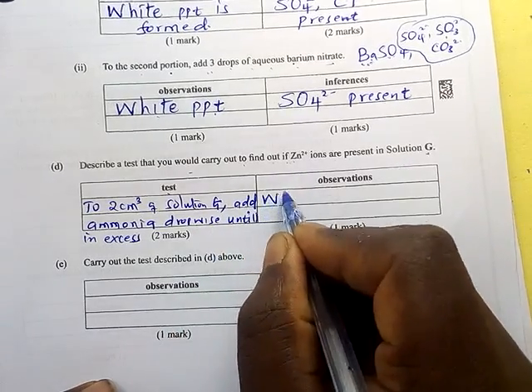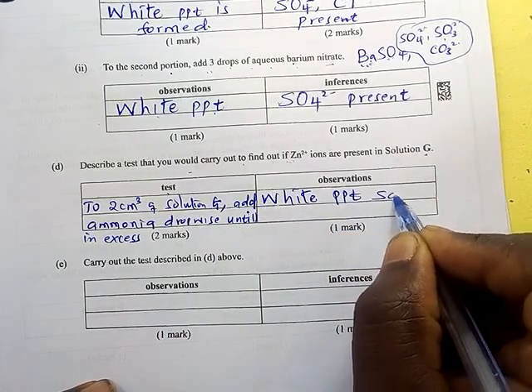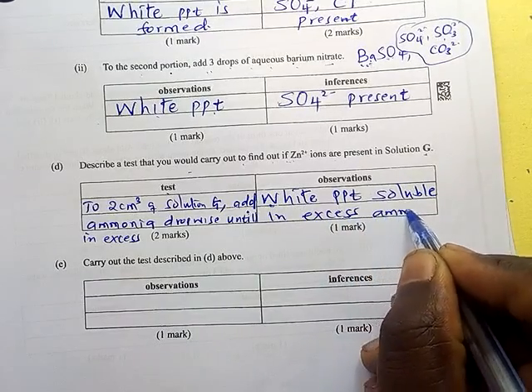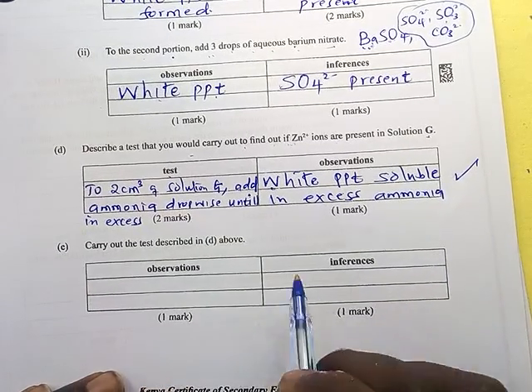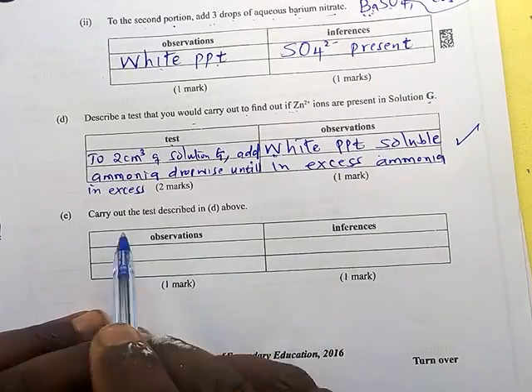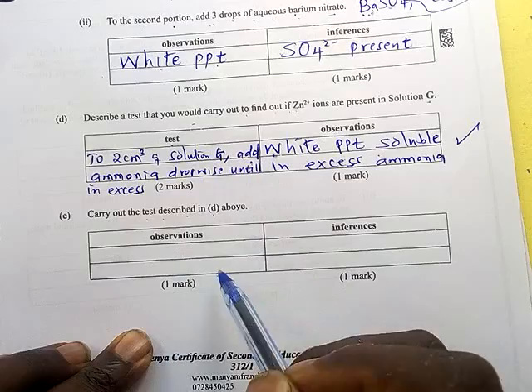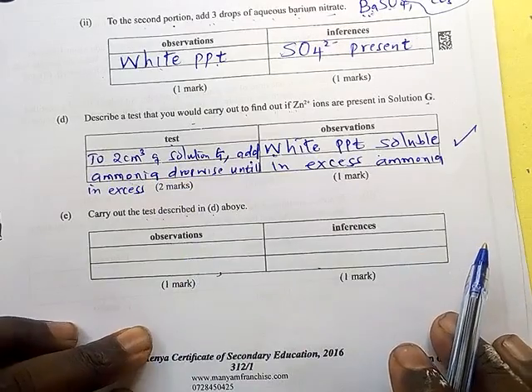So: white PPT, soluble in excess ammonia. So by doing that, you have described the test and given the expected observation. Now the next question is to carry out the test described in D above. So suppose you describe the test wrongly, even this question you will get it wrong. But if it is right like it is, then you are going to get the correct answer.